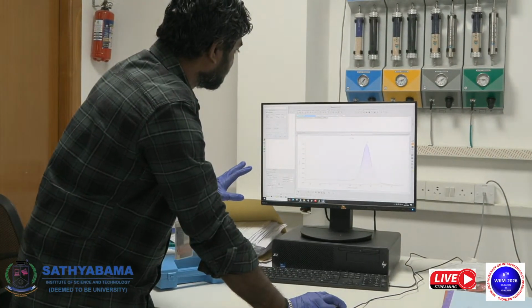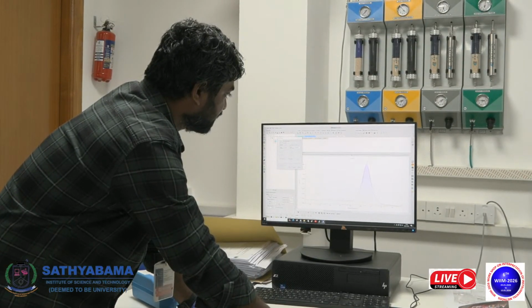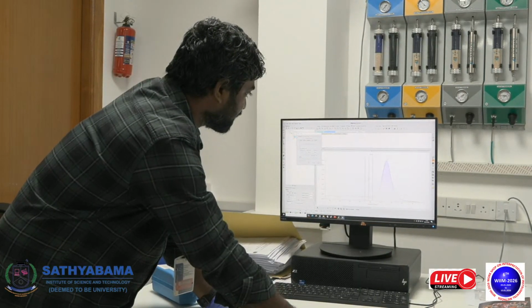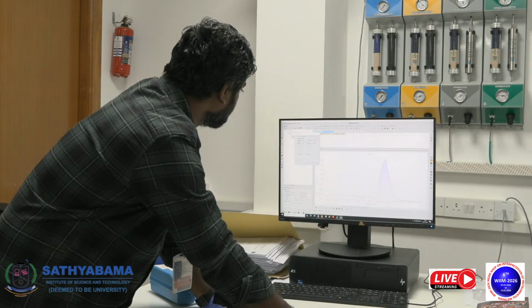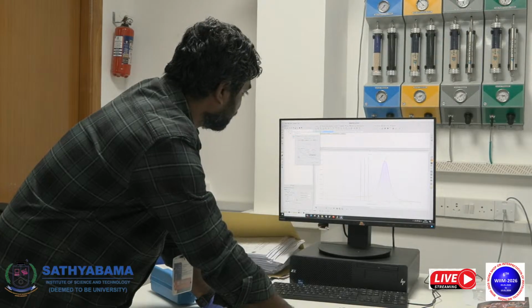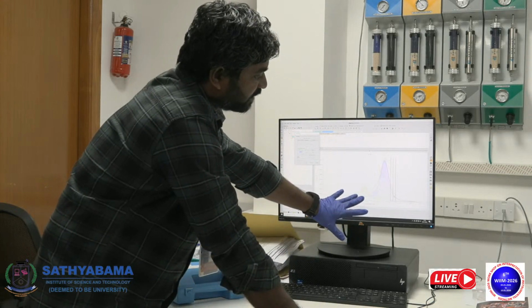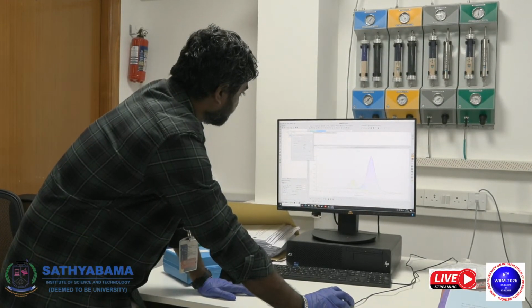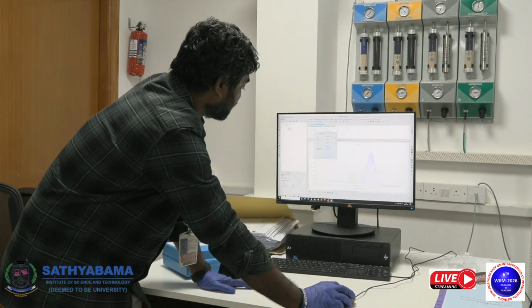The software itself automatically chooses how to fit the data. Now you fix this data, then here you have the reference, then you have to choose this second one. You have to come from this side, and here I am adding one peak, and another one here. Here in the reference there is also no peak, so from this just go and fit this level. Okay, then again fit this level, then again fit this level. So now it's fitted roughly.